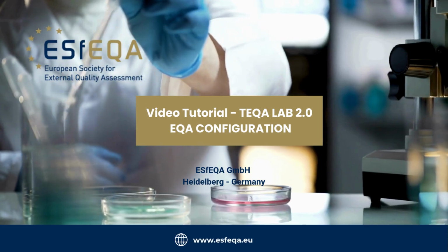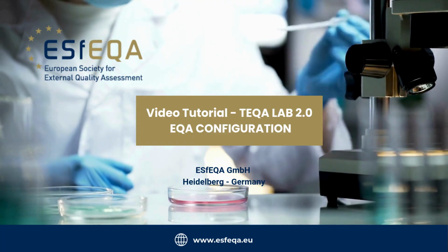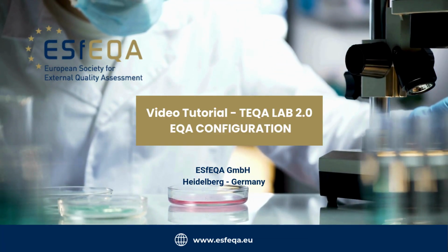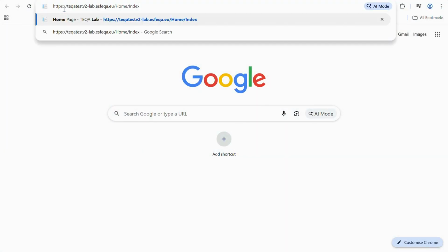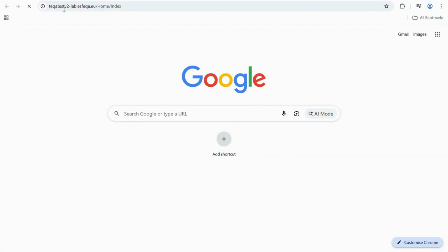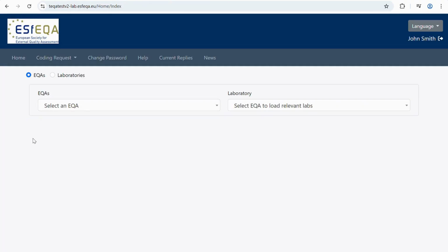Welcome to ESfEQA. In this short video, you will learn how to configure an EQA and a laboratory in our TEQA LAB web application. First, open your web browser and go to the TEQA LAB website. Enter your username and password, and then click Login.